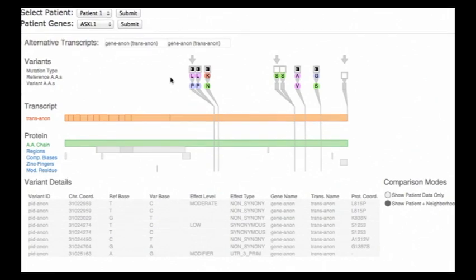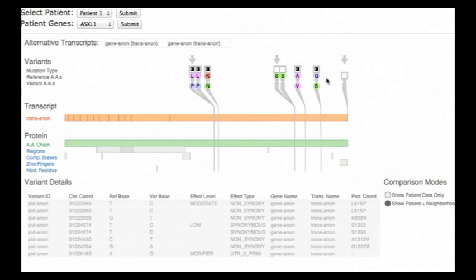The first two variants clearly have exact matches with the known harmful database. But the one on the right probably does not. The G to S variant to its left is sufficiently far away and different that it does not seem to be a match.